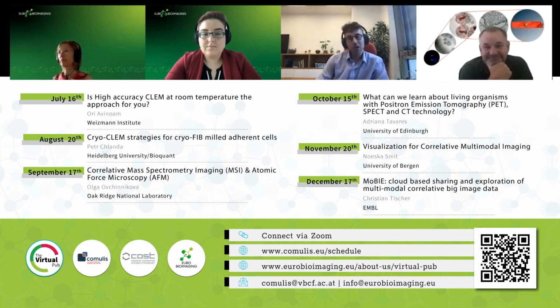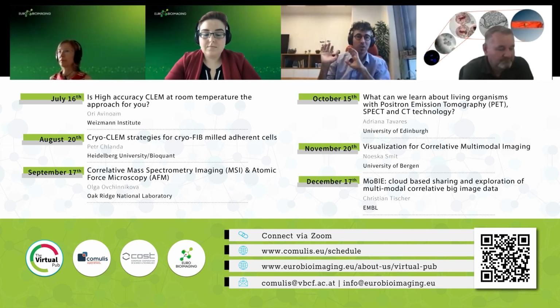Sure. So what we did, in order to deal with this, is that we do one imaging session just for mapping. You spend the day on the microscope, taking the same region where your fluorescence microscopy images are.